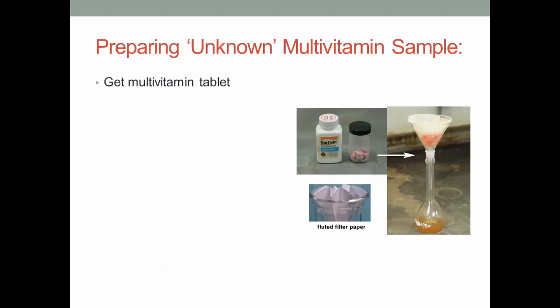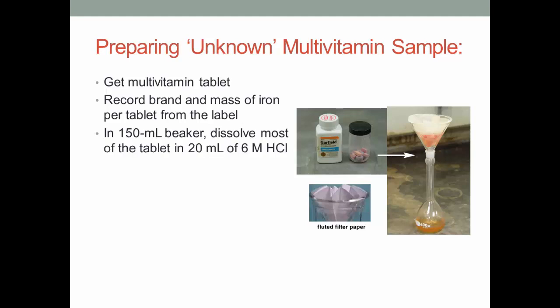Don't forget to read the label of the bottle of vitamins you are testing. To start, get a multivitamin tablet. Remember to record the brand and mass of iron per tablet from the label. In a 150 ml beaker, dissolve most of the tablet in 20 ml of 6-molar hydrochloric acid.